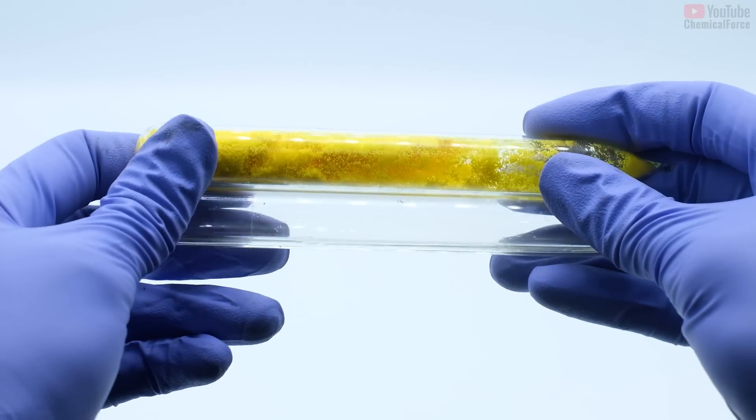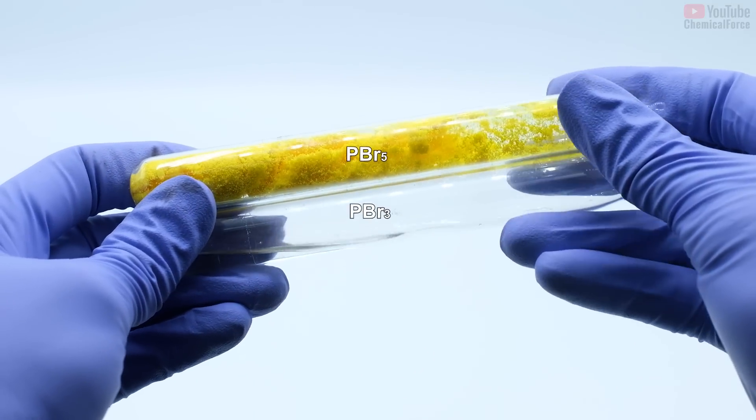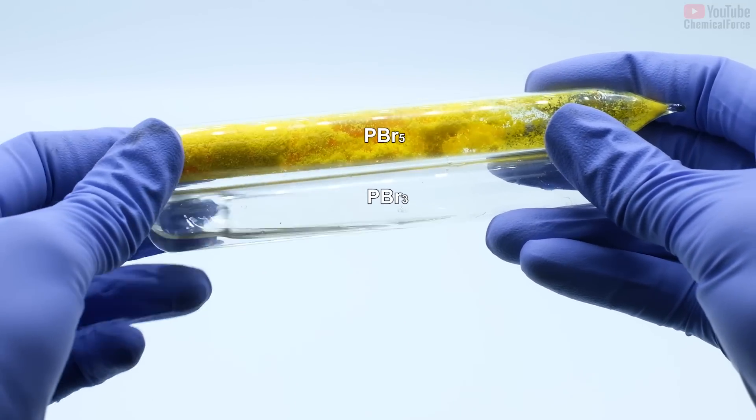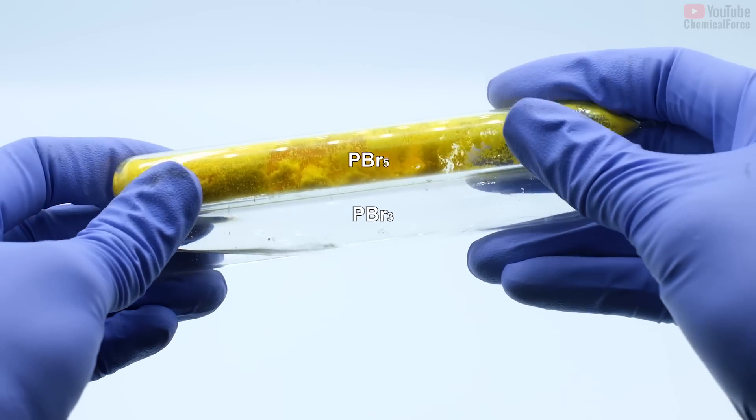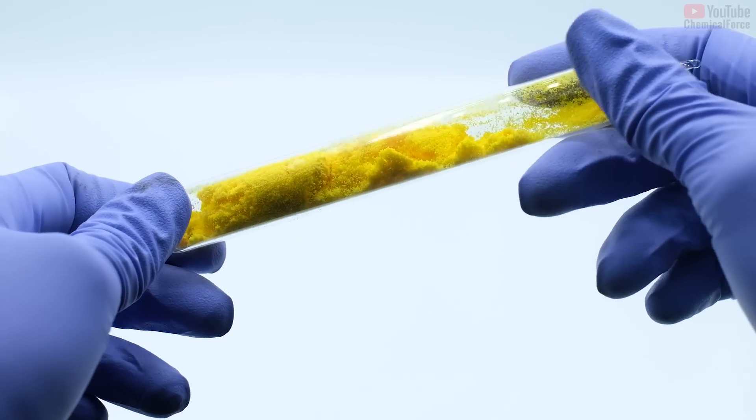I'm holding ampoules with these reagents. The liquid one is phosphorus tribromide, and phosphorus pentobromide is a yellow powder that this video will be about.